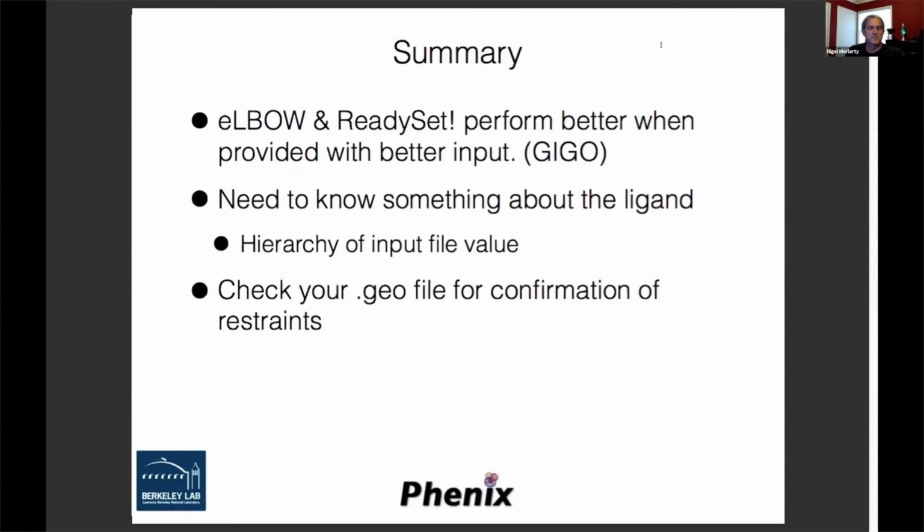There is a comment. Jane? We do have, oh, sorry, feedback. Okay, we were having feedback problems between our two computers. Sorry. But there is an option in Phenix to link to ERRASER. If you really want to fix nucleic RNA backbone, that's the way to go. But it requires setting up Phenix and MolProbity and Rosetta, which is not simple, but it's incredibly effective. We've spent years trying to edit nucleic acids by hand, and I don't recommend it.